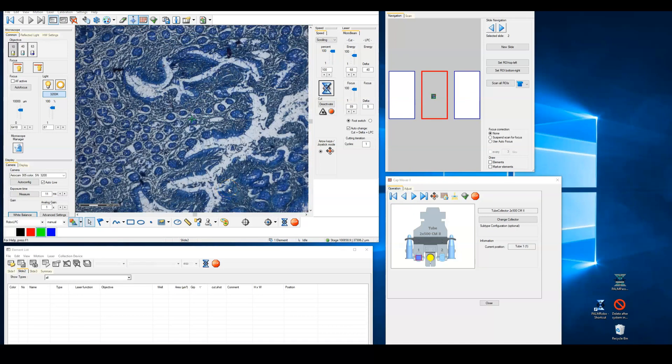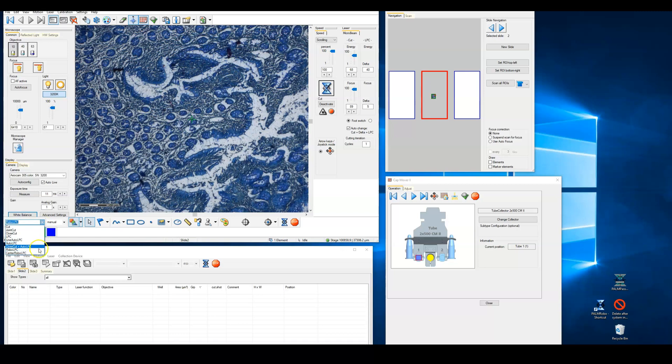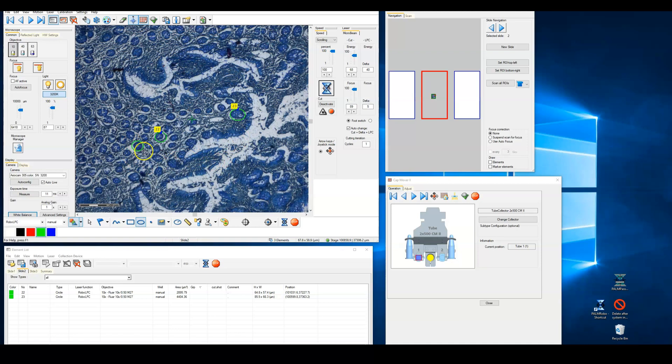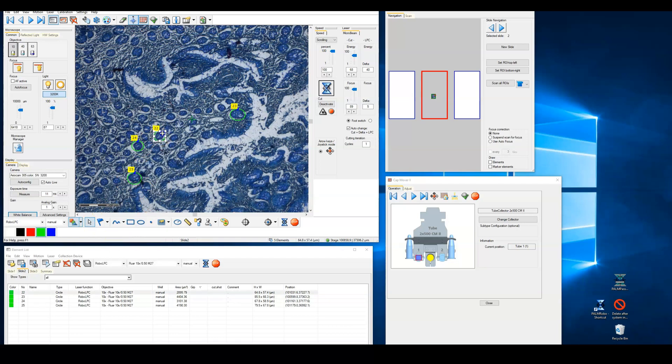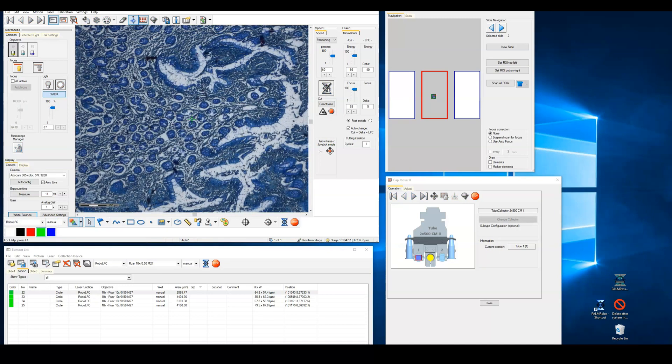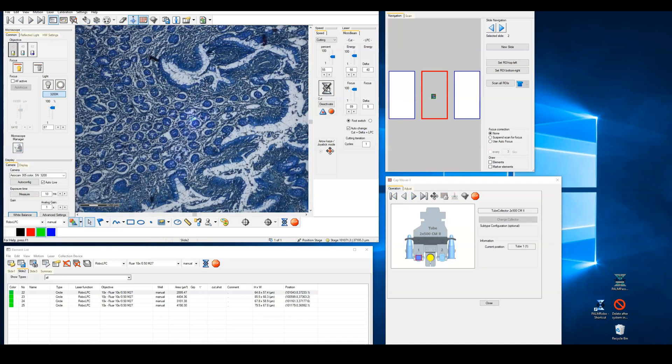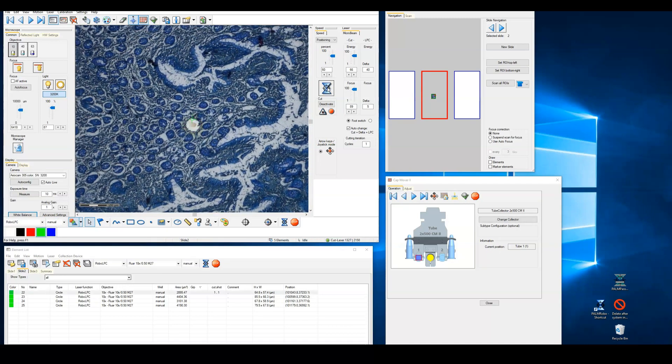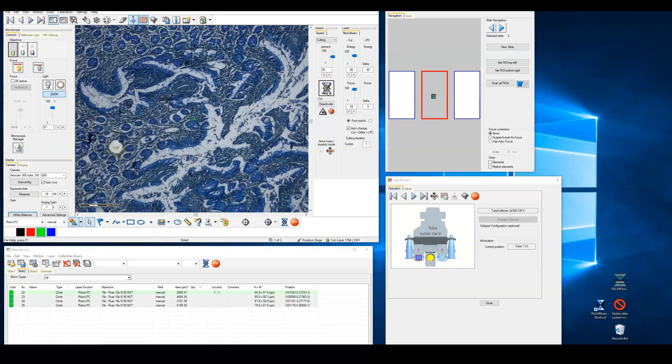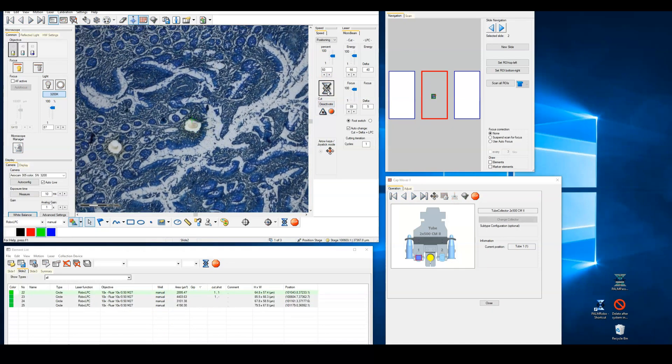The sample that we initially demonstrated on was prepared using a second type of method. This is a slide that is covered with an inert UV-absorbent membrane. This membrane is only attached to the glass slide around the edge of the slide. The effect is that cutting the membrane in the center of the slide, where the sample is typically mounted, allows for a full region to be released from the slide with a single catapult step. This method can provide a slight increase in yield, as the tissue remains intact and a larger fraction of tissue is isolated. The cut method for using a membrane slide is named Robo-LPC. In this cut method, the region of interest is cut fully, with the exception of a small portion at the start point of the cut. This portion is referred to as the bridge, and it works to stabilize the tissue so that it does not fly away from the surface tension that's released as the membrane is cut. An automatic catapult pulse is then applied to the bridge, and the tissue region is captured.